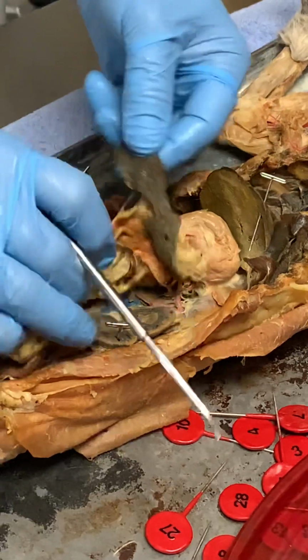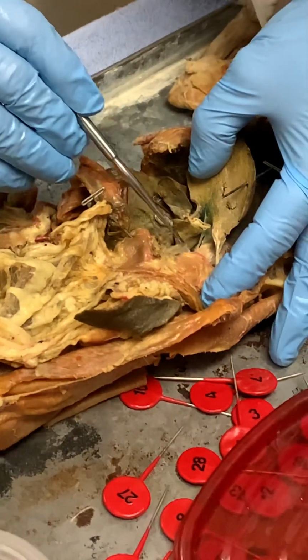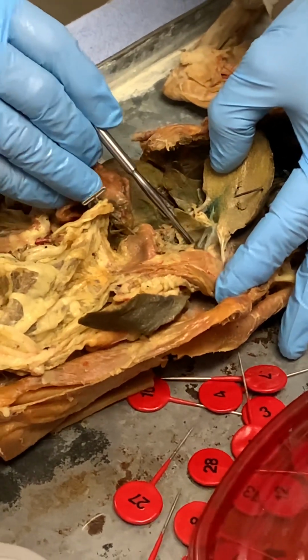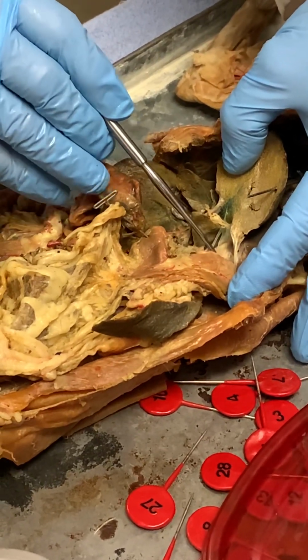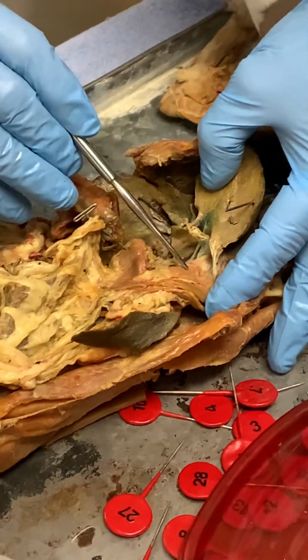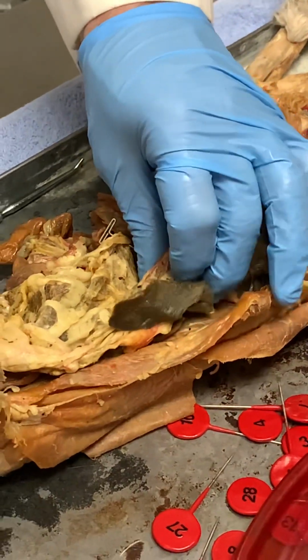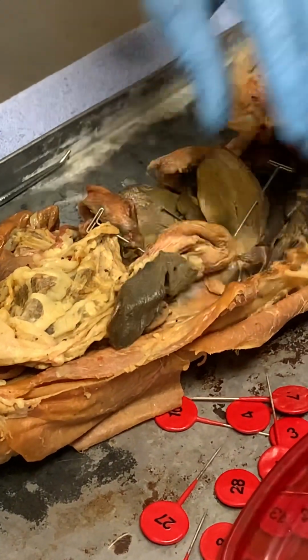Okay, and then Reggie labels it, oh, I'm sorry, the cardia. Yeah, the cardia is right here, just as the esophagus goes into this stomach. This area here is called the cardia. Very good. Okay, and let's go to the larynx next.